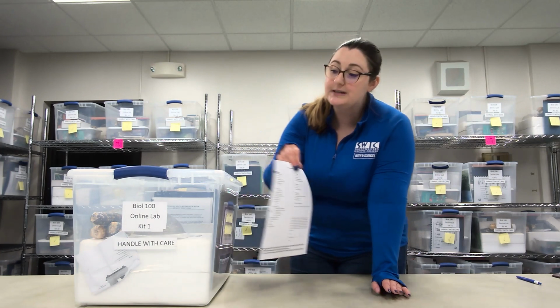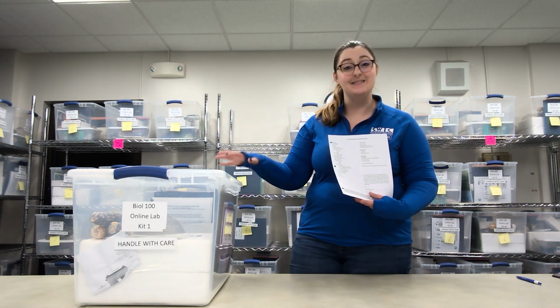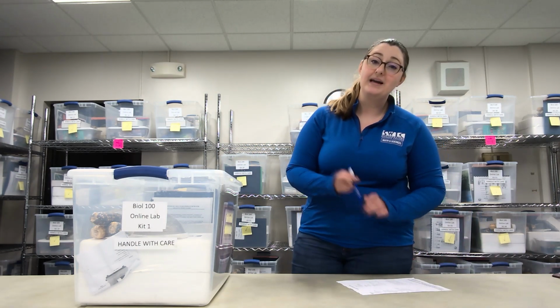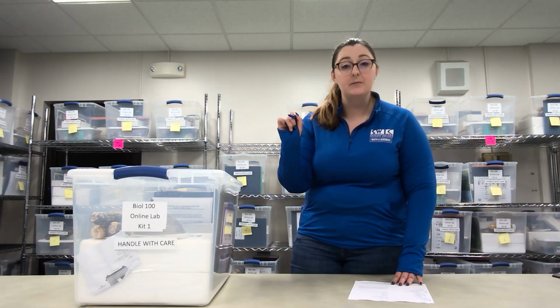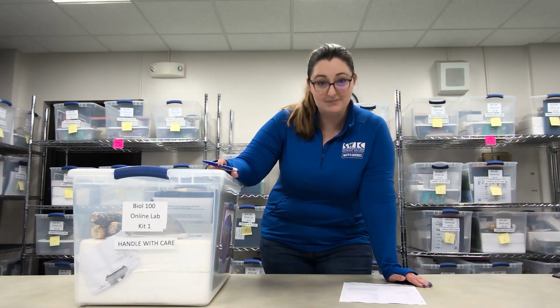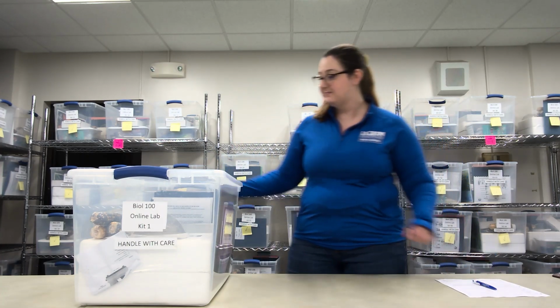What we are going to do is go through the kit, make sure that everything on this list is in this box. You are going to use a pencil or pen to check off the items that are in the kit. If something is missing, you will circle the item, and then after this video, we will make sure that you get that missing item. So let's go ahead and get started.